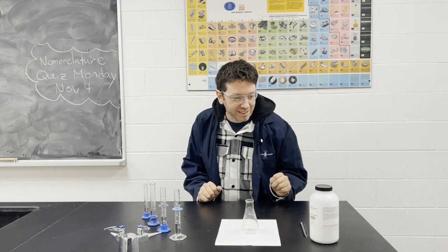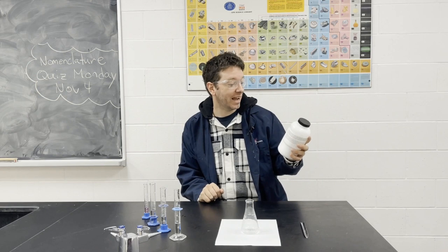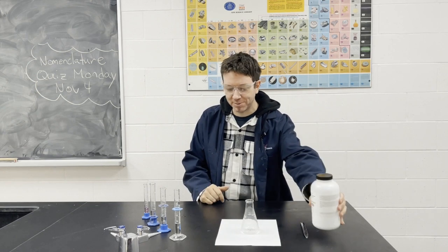All right, so let's try this again. We're going to test a rate of reaction, but this time our possible catalyst is going to be potassium sulfate. Let's see what happens.